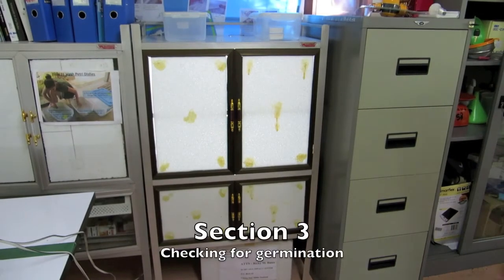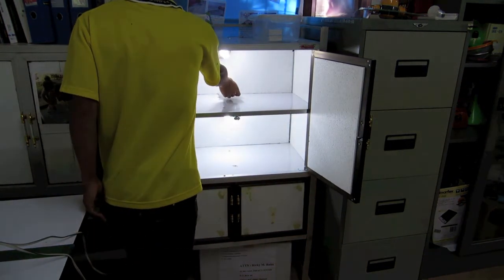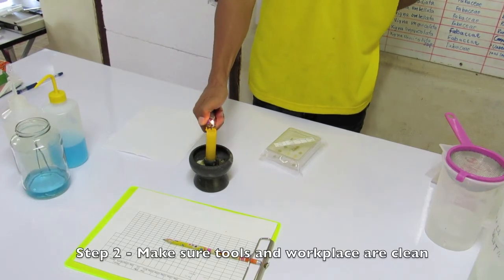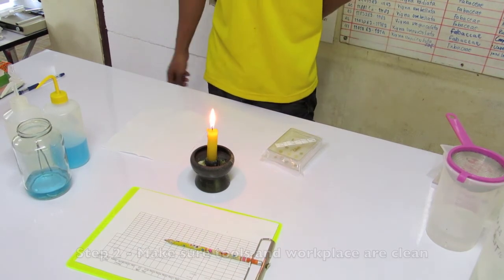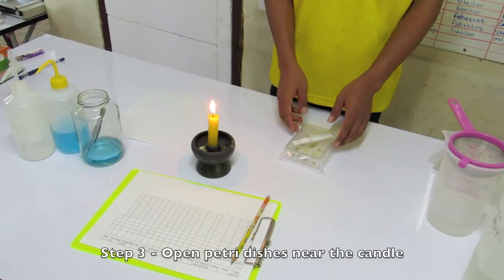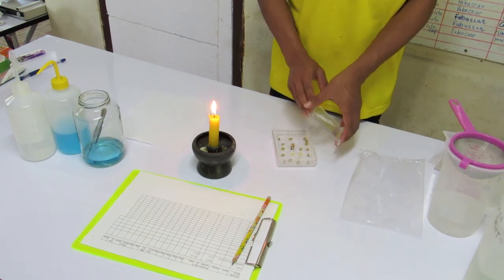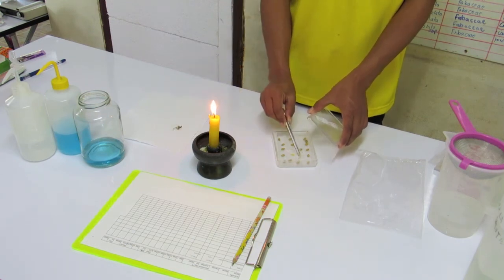Section three: checking for germination. Number one — leave petri dishes in the cabinet overnight. The following day, remove the petri dishes to check for germination. Number two — make sure your workspace and tools have been cleaned according to the method mentioned in section one, and relight your candle. Number three — open the petri dishes one at a time near the candle, holding the lid slightly above the base while you work. These measures will help reduce airborne contaminants from reaching the moist paper towel surface.